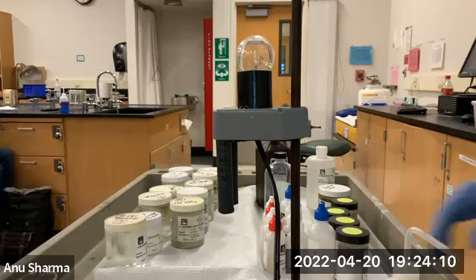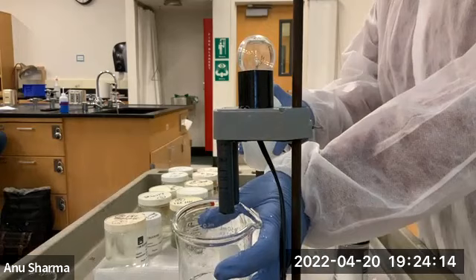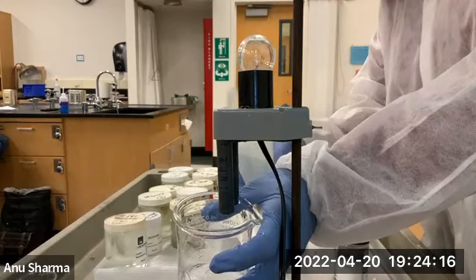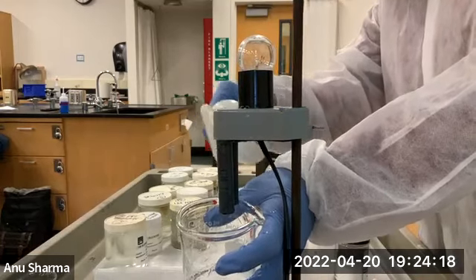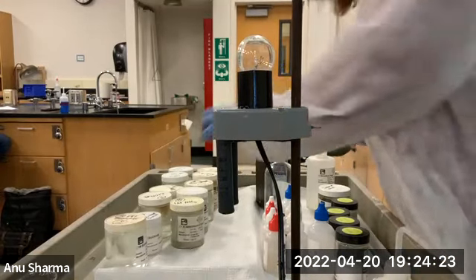Now, this is the difference between the OH that we talked about, the OH that was present in C2H5OH versus the OH present in NaOH. I'll show you. Here is the NaOH.